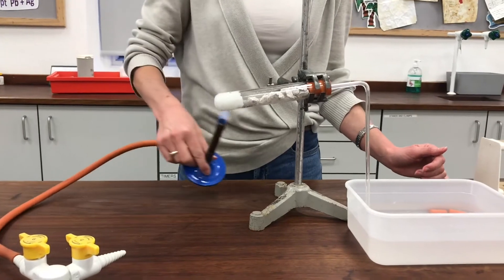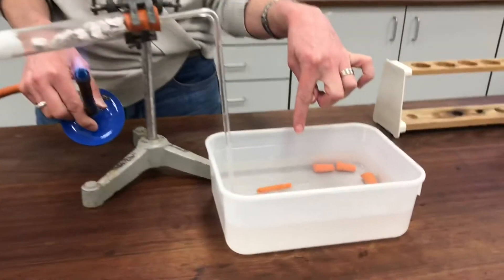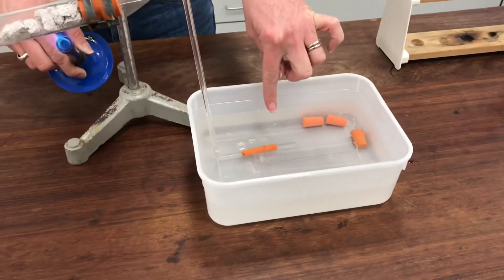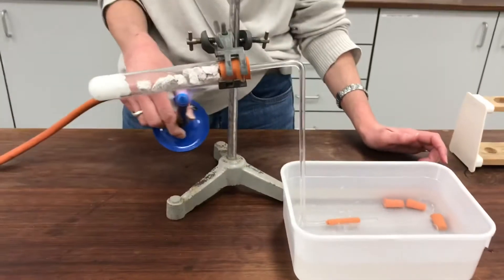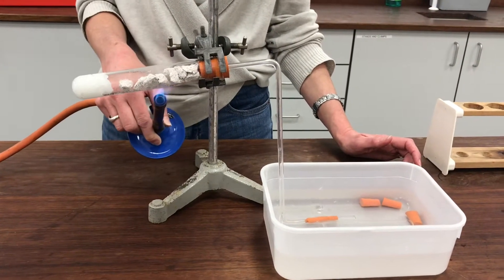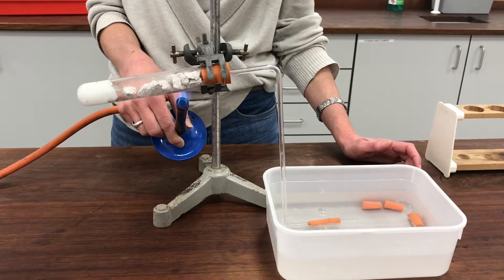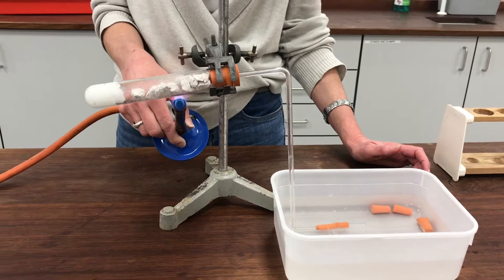The first job is to heat the catalyst. Now as I heat the catalyst you'll be able to see there's some bubbles coming out of the end of the tube. Now those bubbles are just air that's expanded from the apparatus as I've been heating it. So I don't want to collect those just yet. I'm just going to heat the catalyst for a little while until I think it's nice and hot.